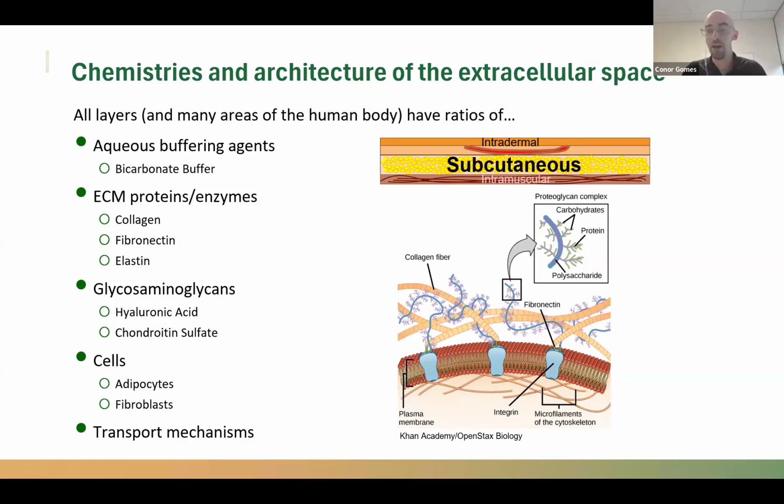There are issues with batch-to-batch reproducibility with cells, which is why on your site it's a different conversation. But at least from Pion's standpoint, it's a very hard thing for us to do. But yeah, the systematic uptake would be equivalent to that lymphatic or circulatory uptake. And then as it's sitting in that chamber, it is supposed to simulate as it's sitting in between those adipocytes in that interstitial fluid. So, thank you.